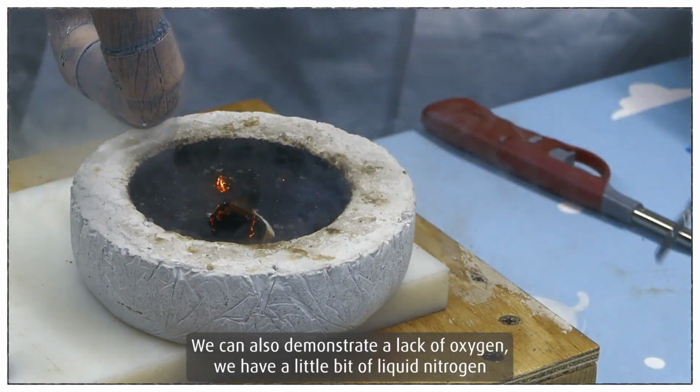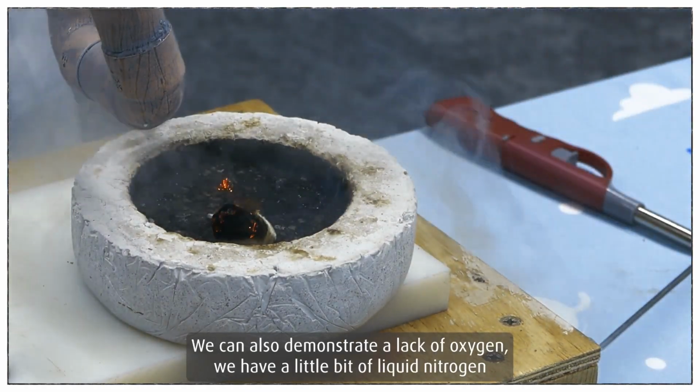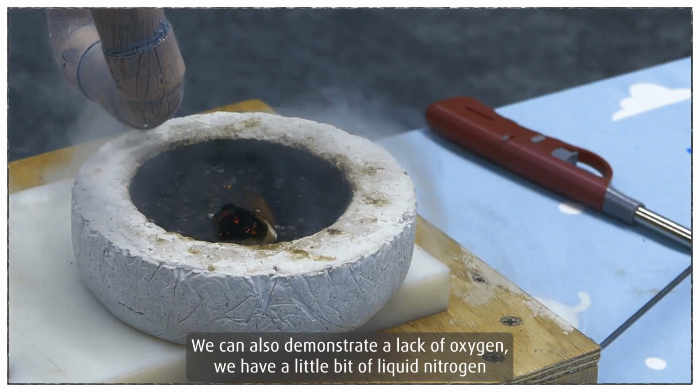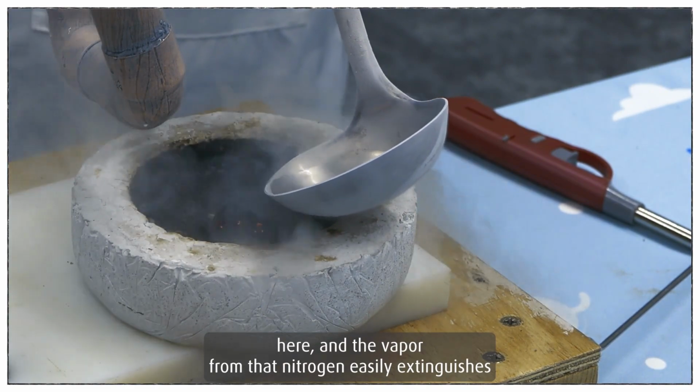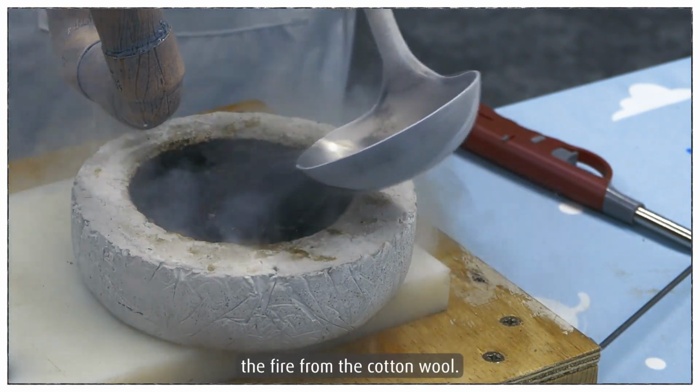We'll also demonstrate the other aspect of the lack of oxygen. So I have a little bit of liquid nitrogen here, and the vapor from that nitrogen easily extinguishes the fire in the cotton wool.